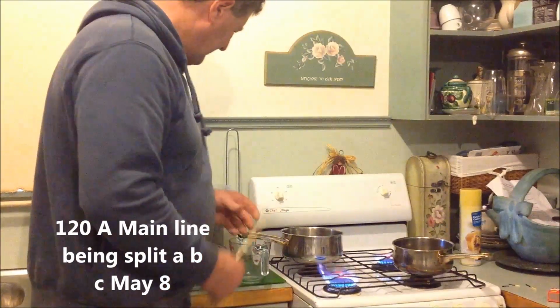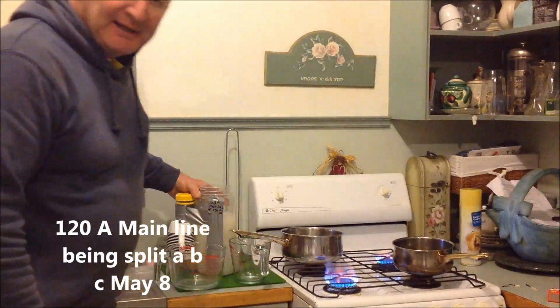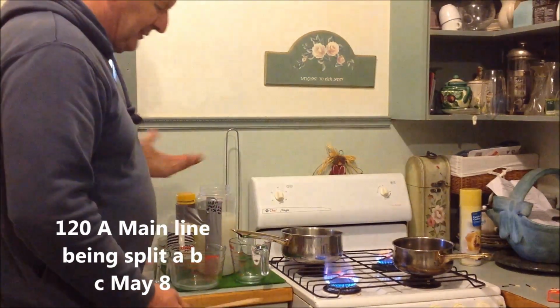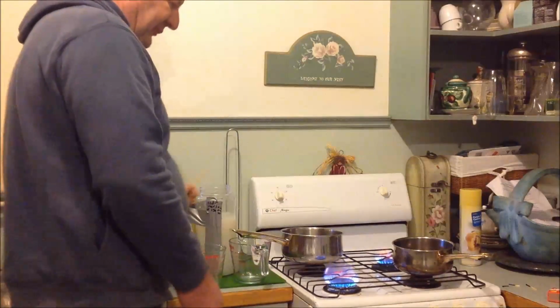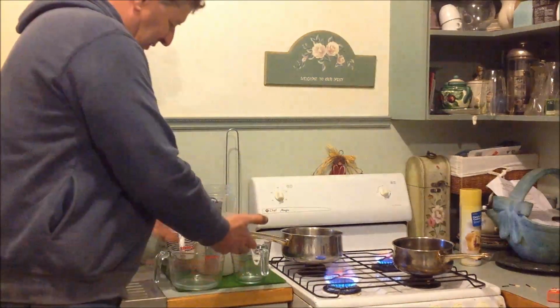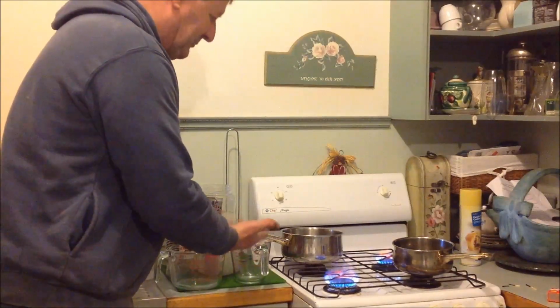It's now been 48 hours and solution 120A has not cleared, so I'm going to apply some heat. I'm going to use some water this time, and I'll be tipping it into these two bowls. It may not all fit. I might have to do it in 2 batches, but we'll see.